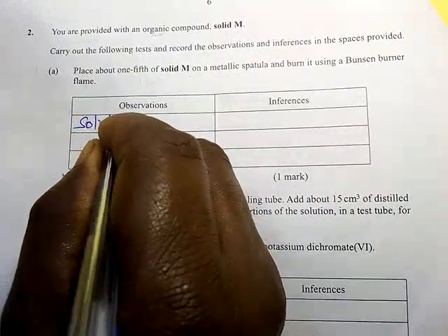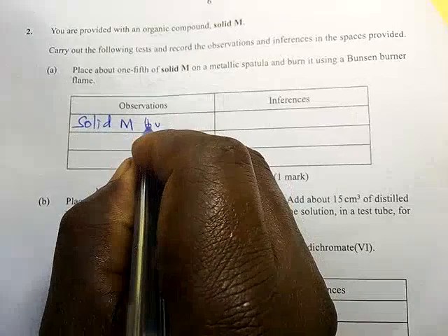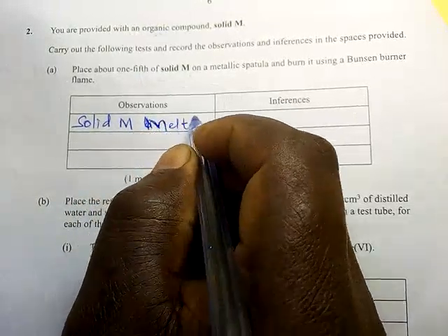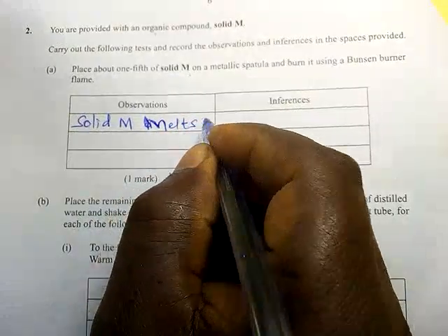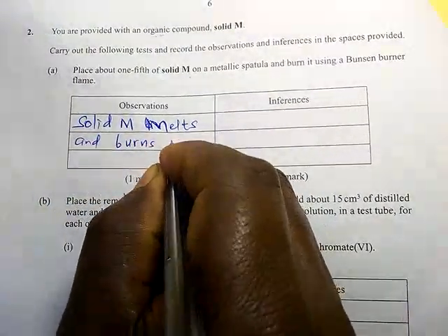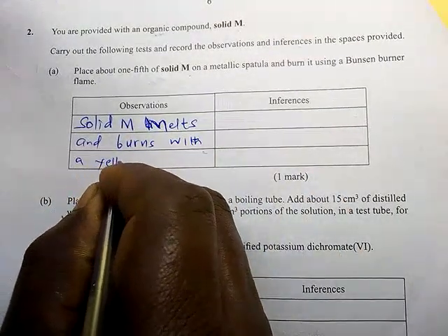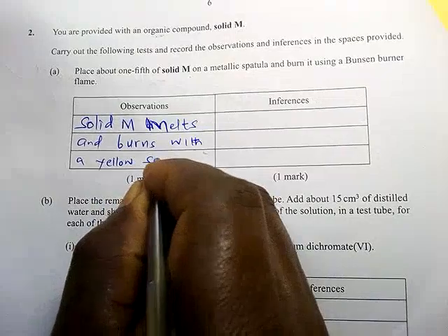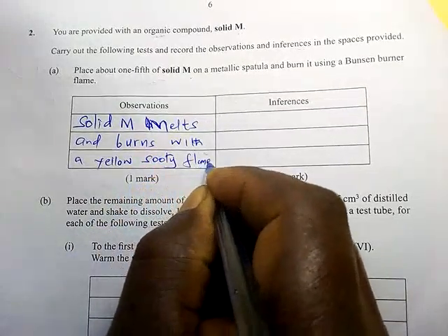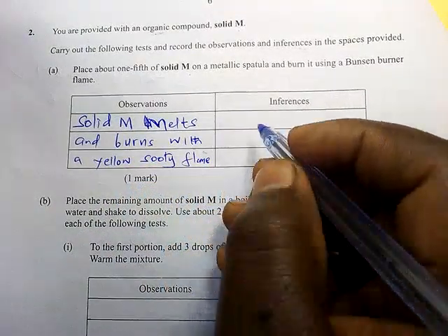Solid M melts first and burns with a yellow sooty flame. That definitely tells you that an alkene or an alkyne is present.